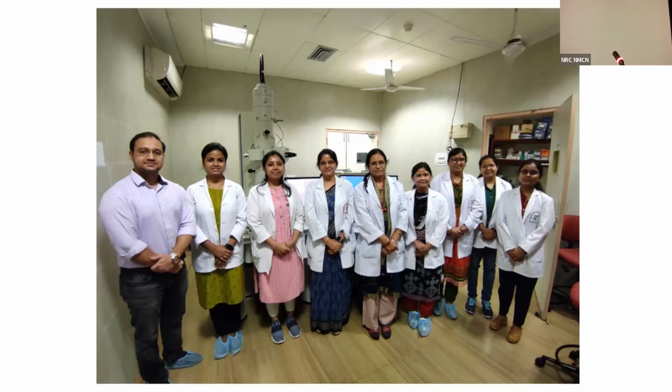But if you want to go into high power and look at each organelle separately, then of course you have to take into account that everything from start to end is very perfect. Otherwise, you will not be able to see those double membranes. Otherwise, processing is almost finished, except when you are doing immunohistochemistry.